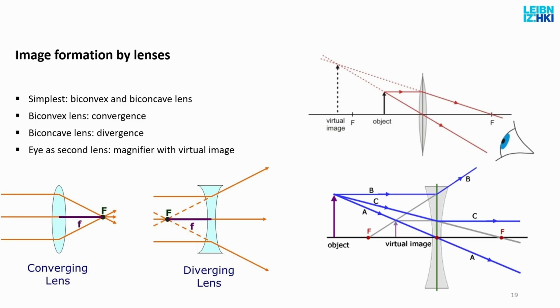So what do I see here? What I see here is that with this very simple object, a lens, I can magnify this object to this. What is this? A 2.5 times bigger image. So if I look at the stamp, it is 1 centimeter. Now it looks like 2.5 centimeters. What I also see is that what was the top of the object is the top of the image.